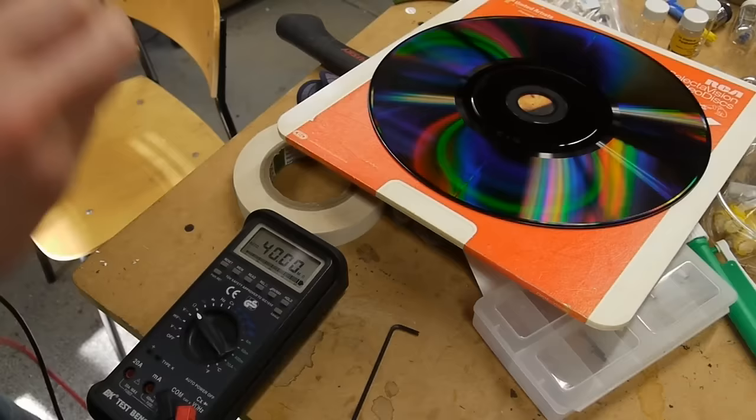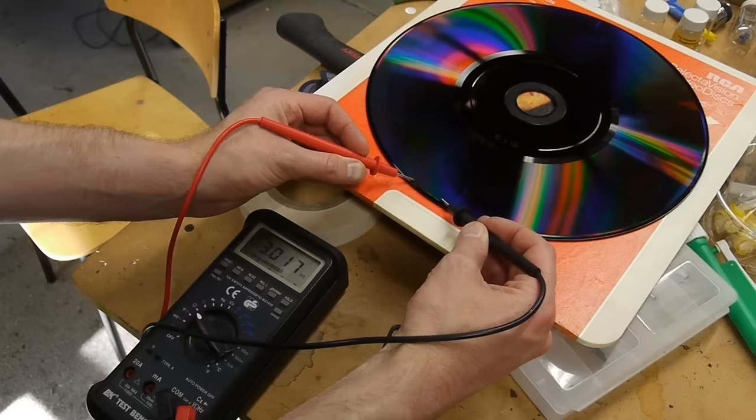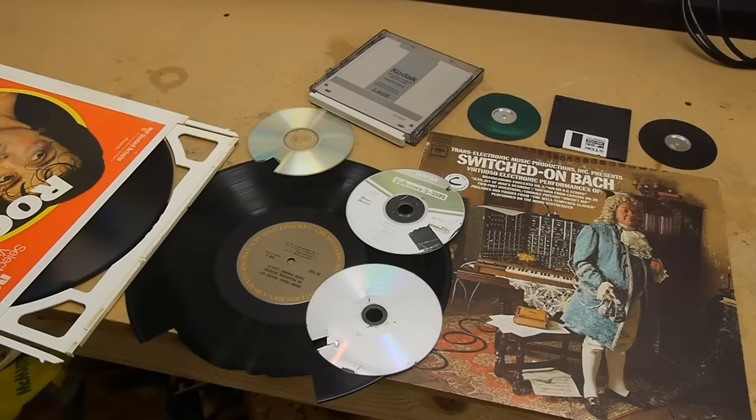Interestingly, this capacitive electronic disk is somewhat conductive, and the capacitance between it and the needle is measured. As it spins around, the track thickness varies, or the trench depth varies. So as it spins, you get this signal correlated with the capacitance change as it goes around.